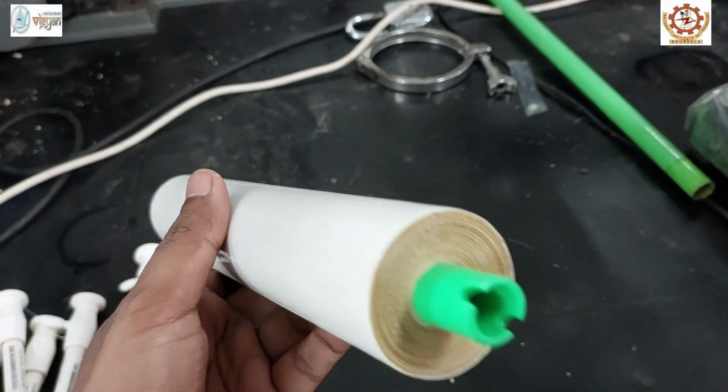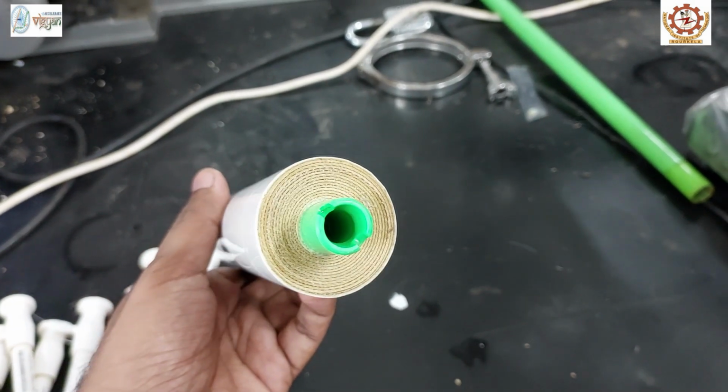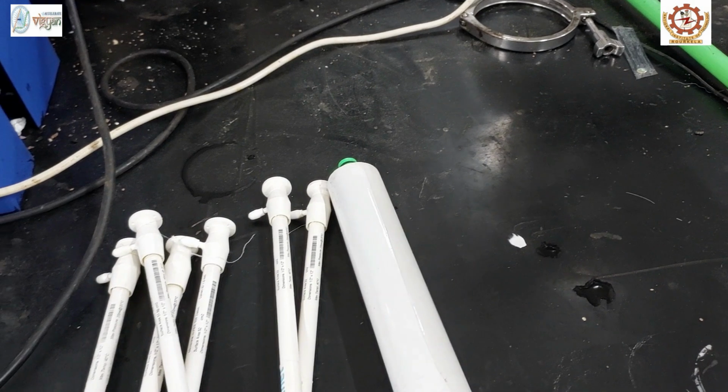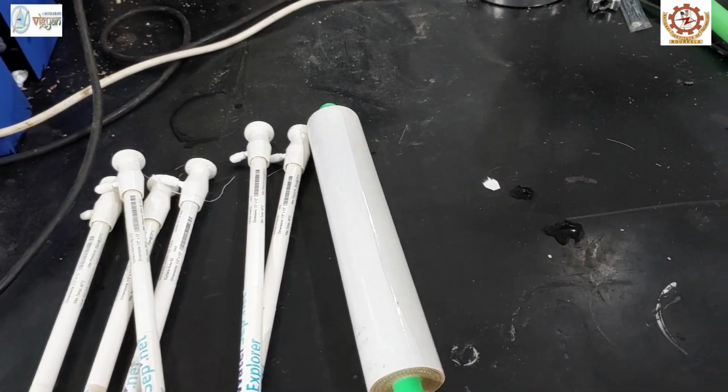The spiral wound membranes are capable of treating feeds with larger volumes, but necessary pre-treatment should be done for highly viscous feeds and feeds with large particulate matter.